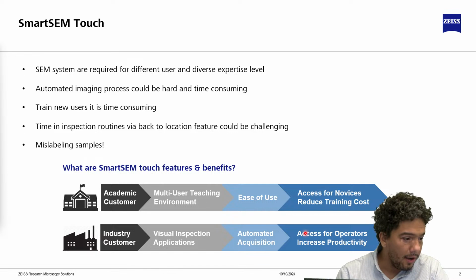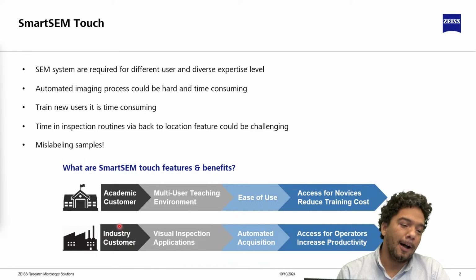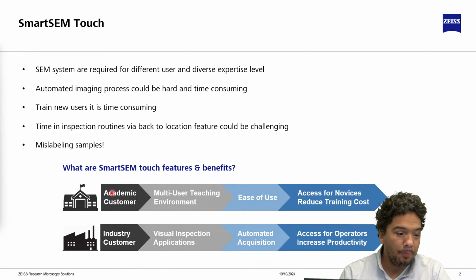Of course, this last part can be applied to academic customers also. Let's see how SmartSEM Touch can help you with this kind of task. Now, Chris will help me with the introduction part of SmartSEM Touch.